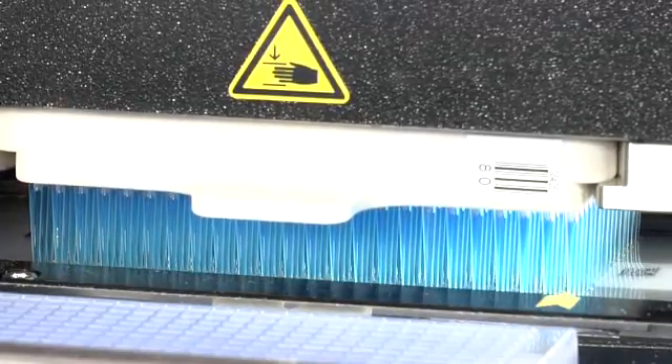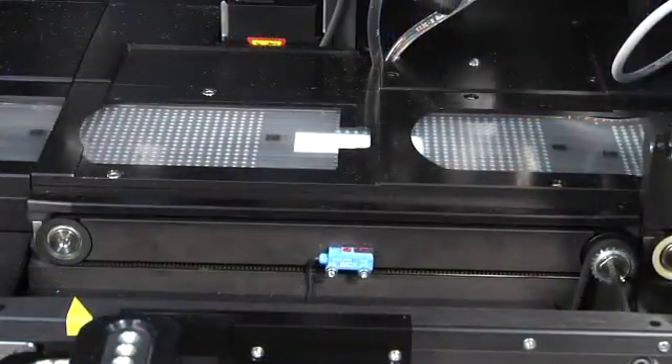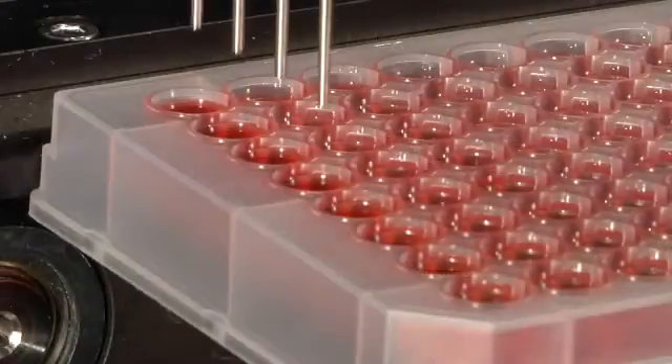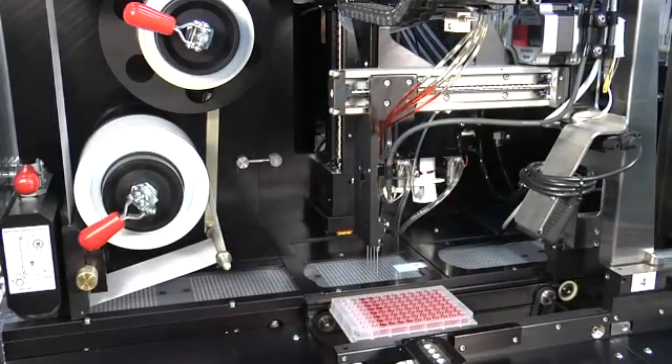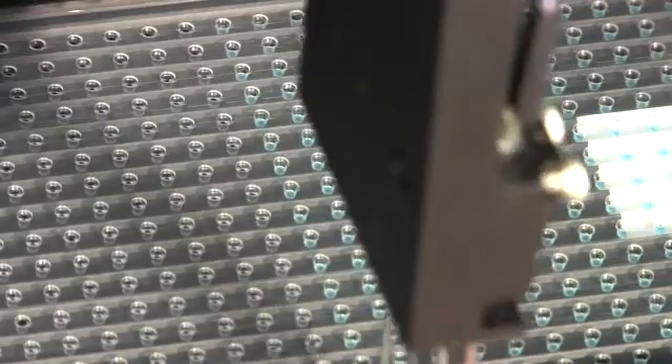Add the DNA sample in 384 wells at one time. The ArrayTape is automatically advanced to the next module, which quickly and accurately adds the master mix containing the primers and probes to the samples already in the wells.